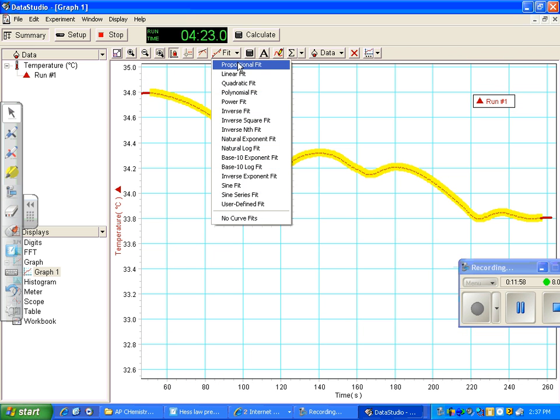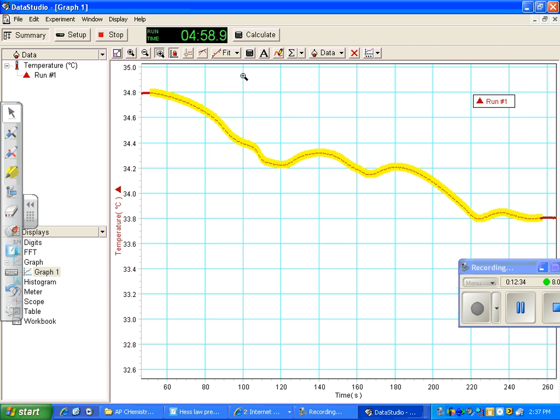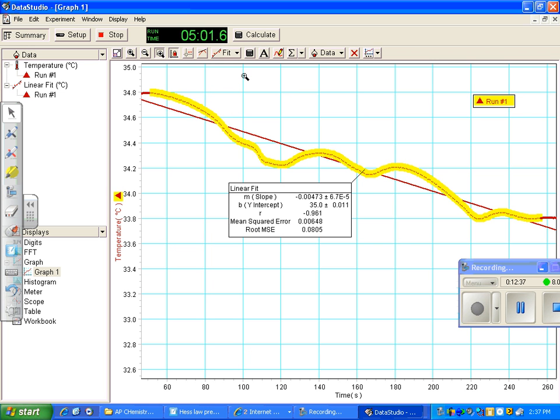And then what I'm going to do is I'm going to hit fit and linear fit. So what that is going to do is it's going to look like that. So you're going to find yours will be a little bit different. Mine wasn't actually a reaction. I just microwaved some water real quick. So what I basically did is I did a linear fit. So you're going to pick this one right here. As you see the mouse pointing to it, it's the fourth one over on the Mac. It's a little plus symbol with a little square, which allows me to target a section where it's fairly linear. Although this is a little wacky. I don't know why this is so wacky. You're going to drag that section highlighted in yellow, and then you can pick fit, linear fit. So I go here, fit, linear fit.